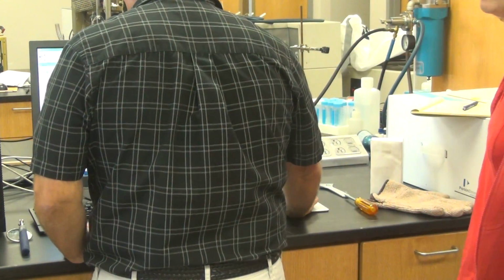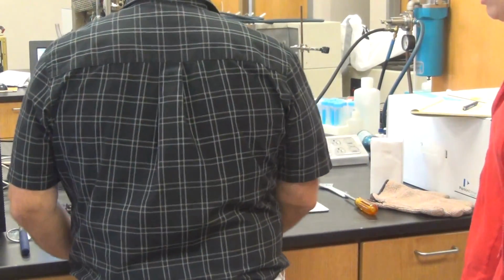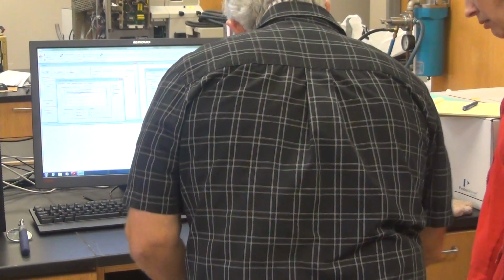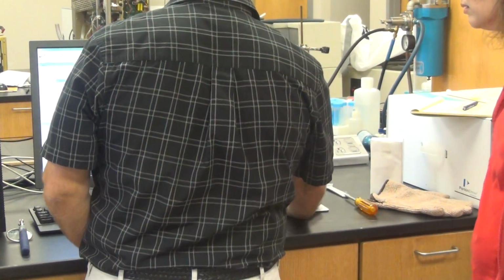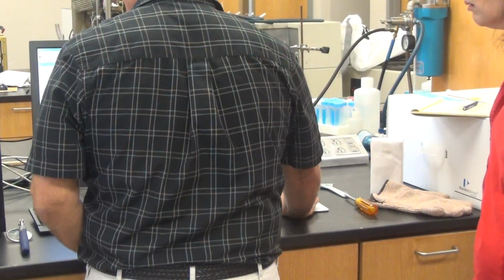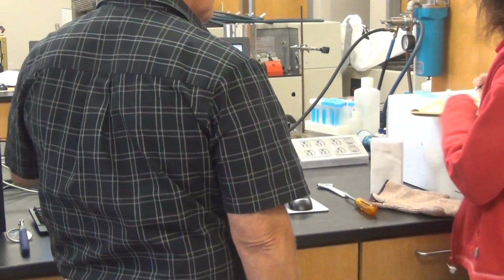Well, does it matter? Yeah, because they're different sizes. You have to tell it that you're using it because it won't know where to go to address the auto sampler, 88 samples, I can't remember what that is, versus 148. Well, you would think it would be under instrument, condition, furnace control, open to close, on tip. There we go. There it is. Under devices, whichever tray you want to use.